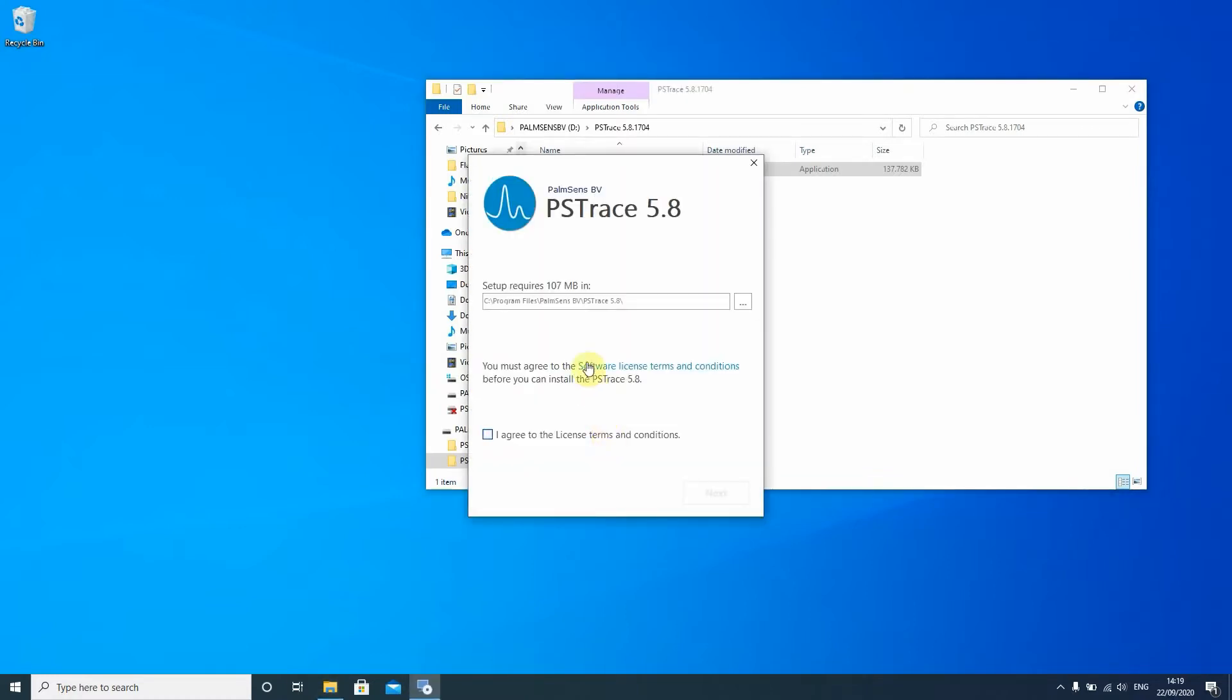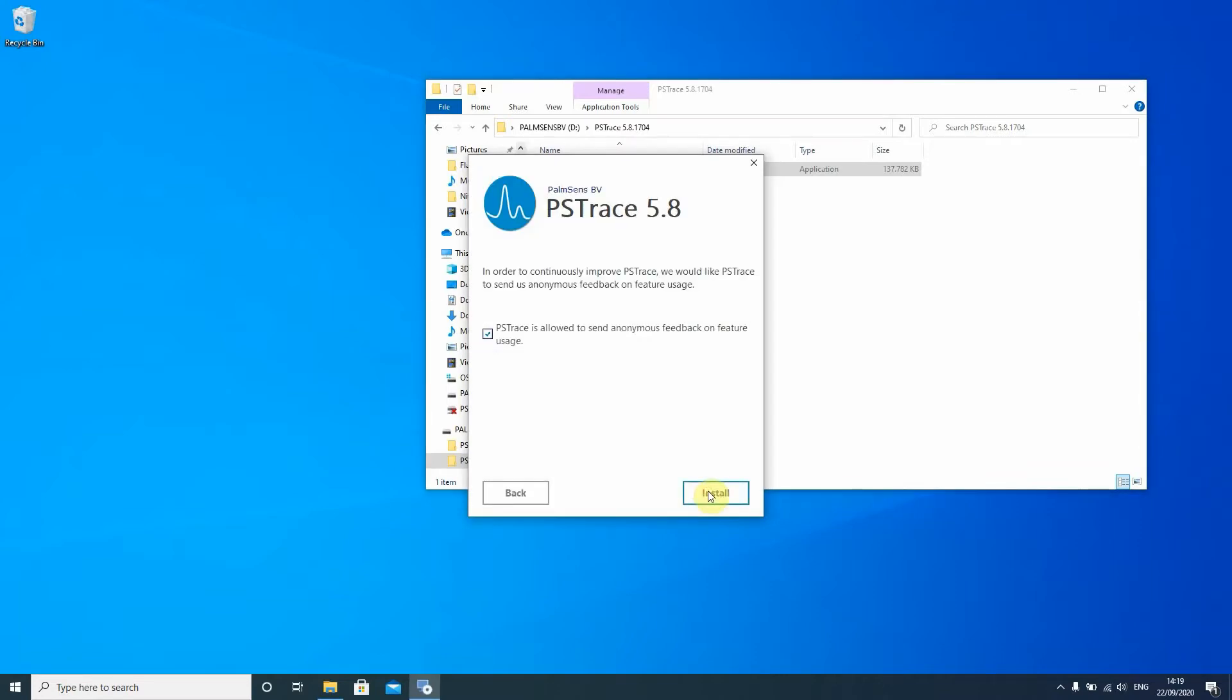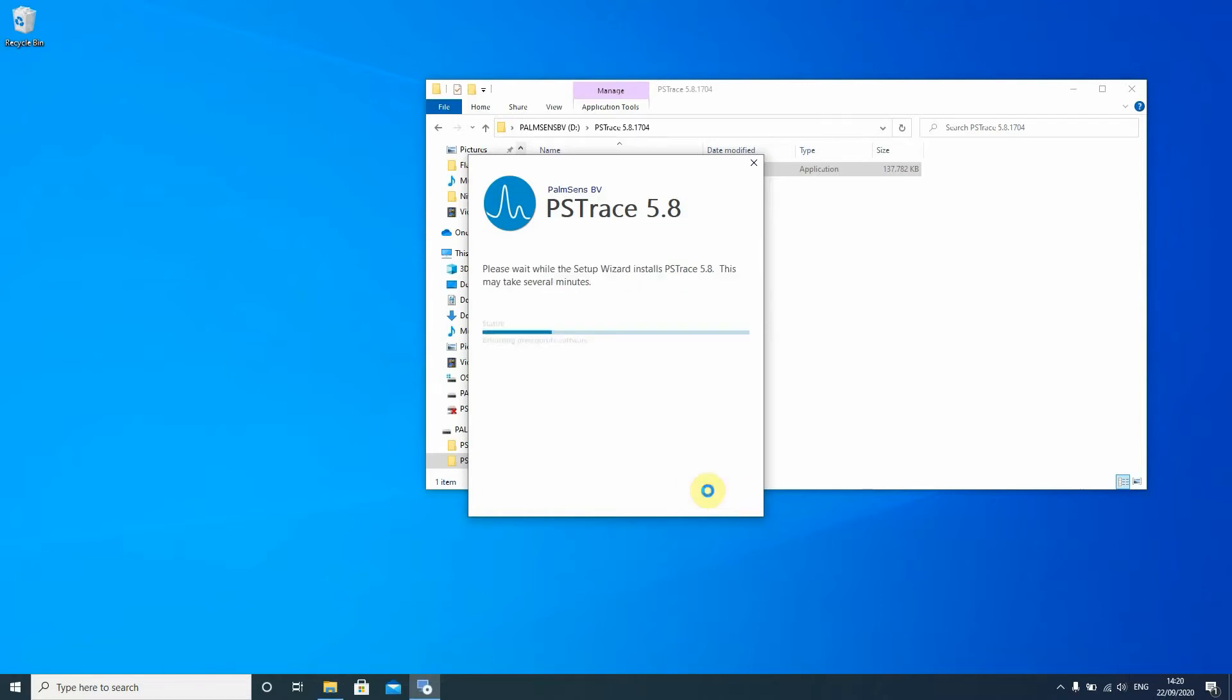Then you have to choose where you want to install PS Trace and agree to our terms and conditions. Then you're asked to help us improving the software. If you want to do that just leave the check there in the box and press install.